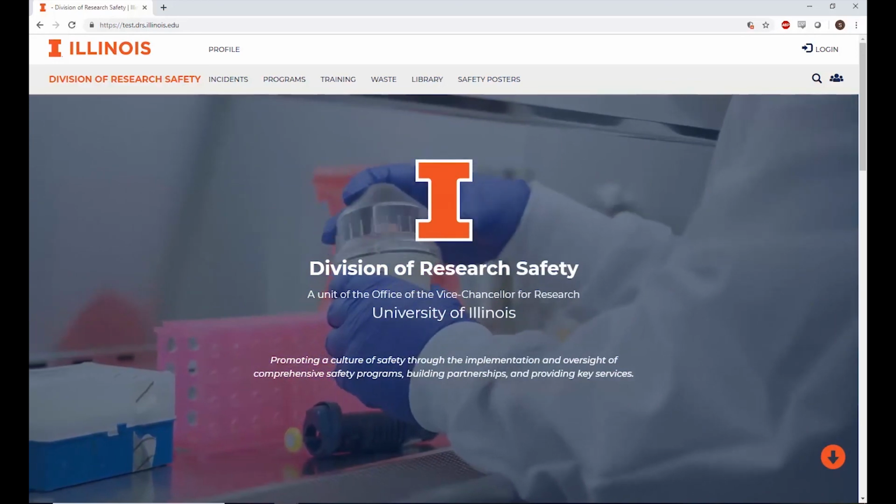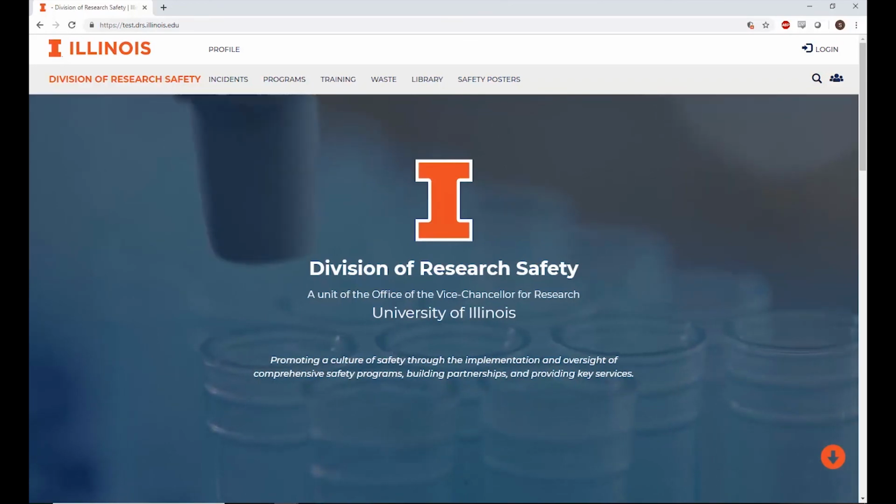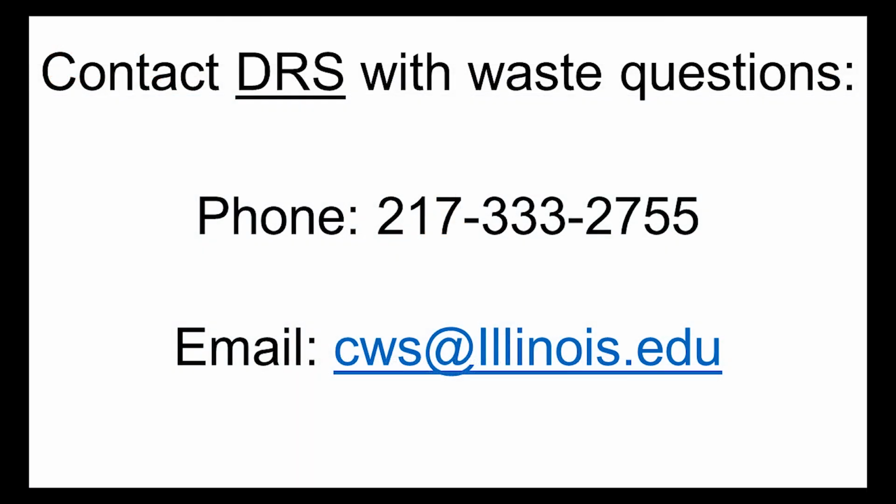If you are unsure about potential hazards of waste, have a particularly challenging case, an unlabeled container, or are not sure what to do with your hazardous waste, please contact the DRS Waste Group at 217-333-2755 or by emailing cws@illinois.edu.